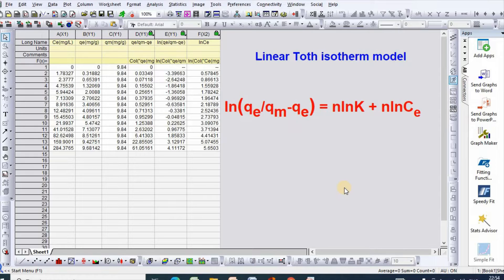In my previous videos, I showed how to fit various isotherm models including long linear Toth isotherm model. In this video, I will show you how to fit linear Toth isotherm model.